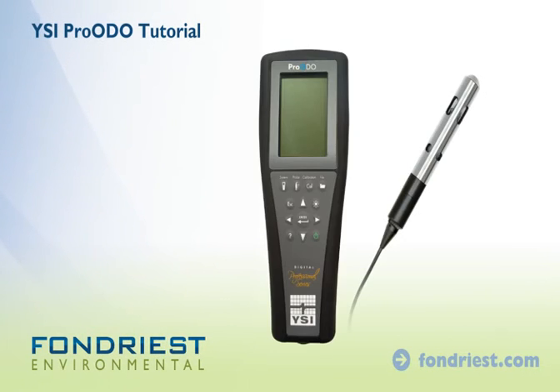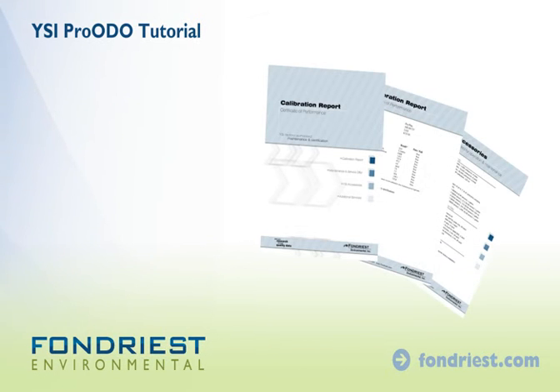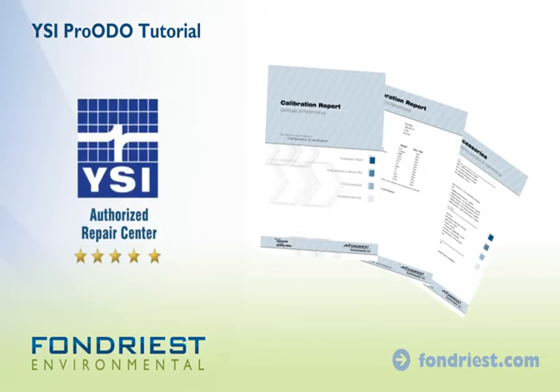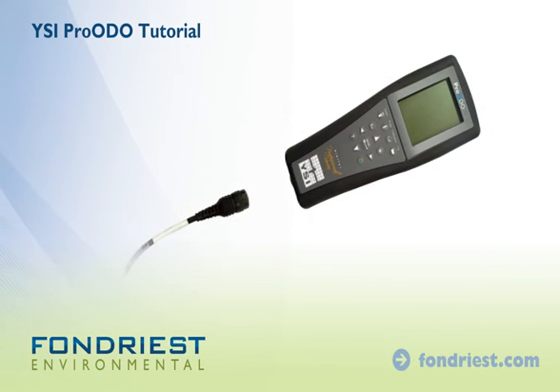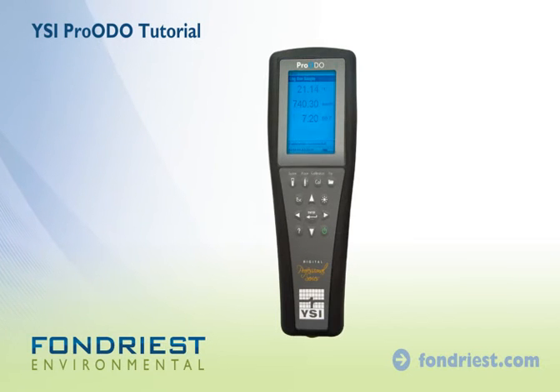The YSI Pro-ODO Optical Dissolved Oxygen Meter ships set up, calibrated, and ready for use. It arrives with a certified calibration report from our YSI authorized service center. Simply connect the cable to the meter and power up. The meter will start in run mode.